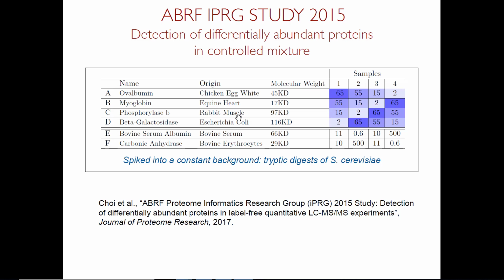These are different proteins which were spiked in. You see that between mixture 1 and 2, 2 and 3, 3 and 4, this protein, for example, changes in abundance quite a bit. And then they added 2 more proteins which had some additional concentrations. So the idea was this: let's have these biological samples, and we will analyze them like this.